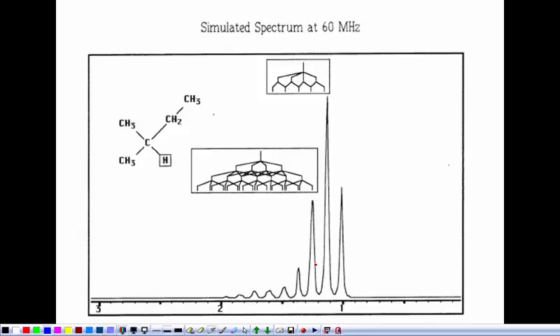Well, people that study molecules that have lots of hydrogens, that have really small chemical shift differences, they care about that kind of stuff. Who are they? People who study proteins, where there's thousands of protons in a very small window of chemical shift. Polymers, which are long-chained molecules. And so the reason that CASE and the Cleveland Clinic and the Structural Center for Biology has that humongous 900 magnet is because they're studying biomolecules where they want to separate these peaks.